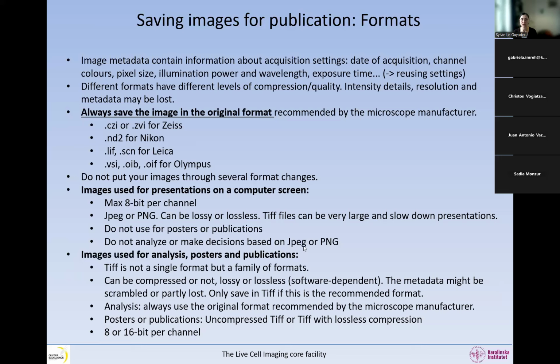For the images that are used for everything, there's one thing that is important to realize: TIFF is actually not one format. Unfortunately, TIFF is a family of formats. And so depending on the manufacturer, whatever they have set, the metadata might be scrambled anyway. So it's not easy to deal with TIFF because you never know which metadata you are dealing with. And that's a bit of a pain.